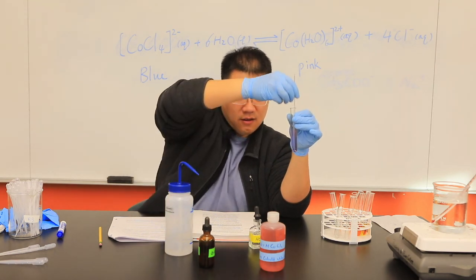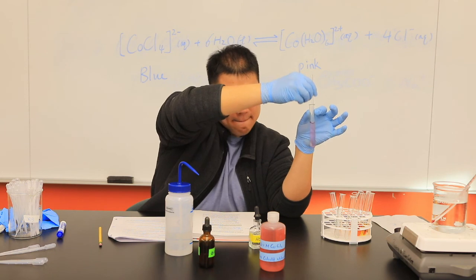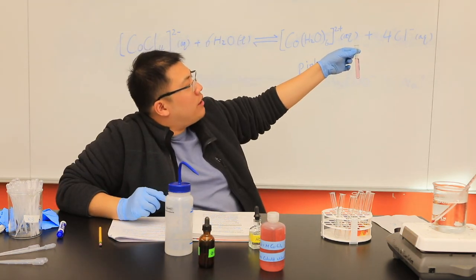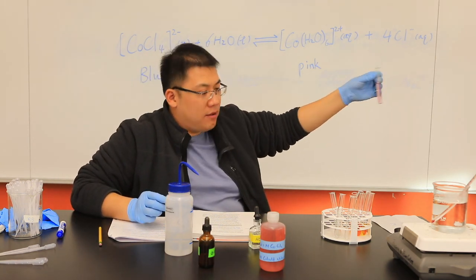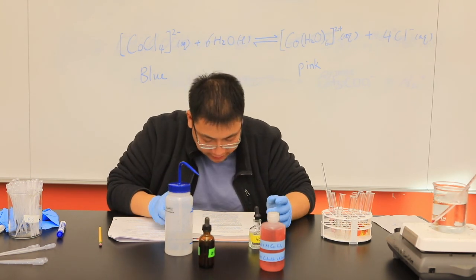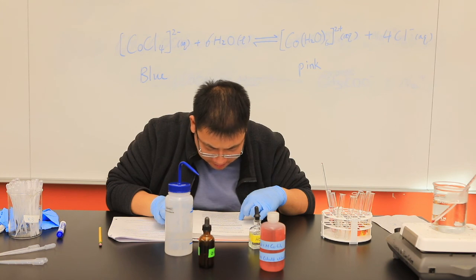Right? Just going to add a little bit more. Alright, now it's more on the pinkish side. Okay, so that's that. Record this observation into number 19 of your data sheet.